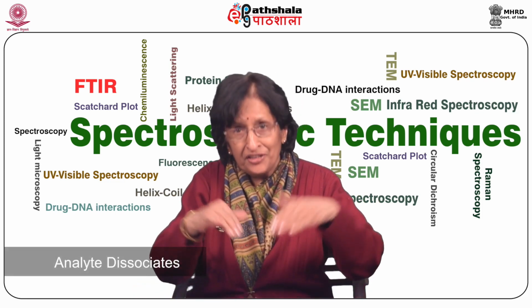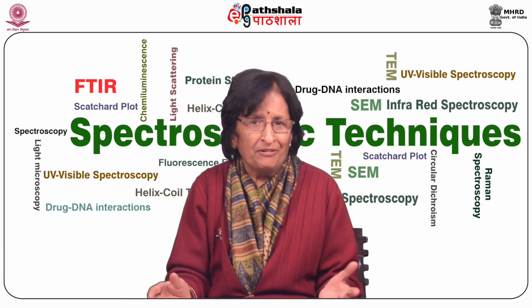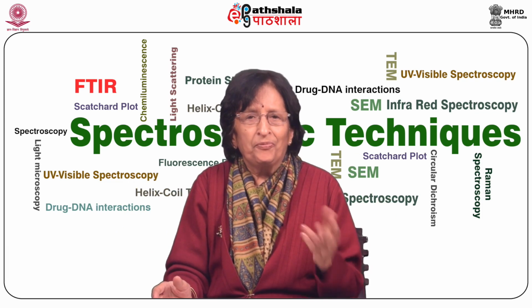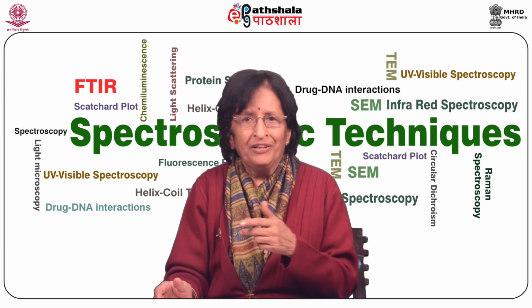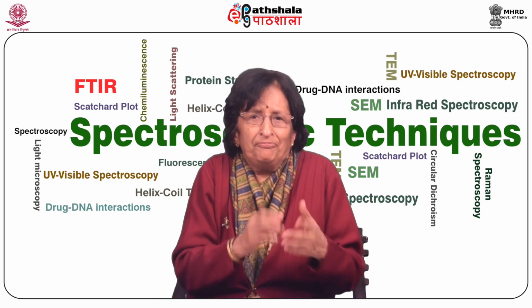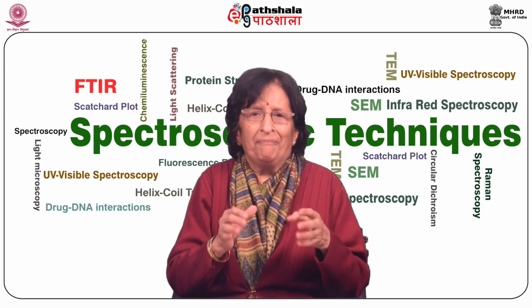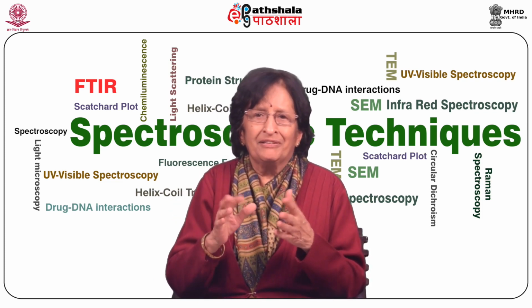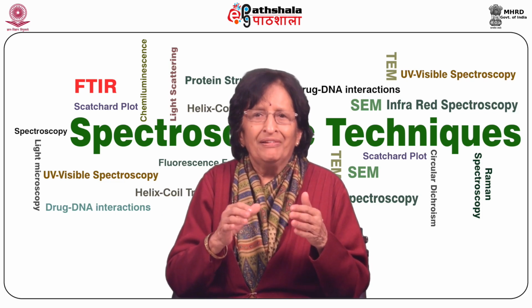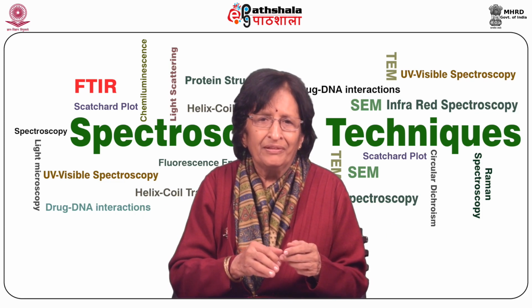Now, if the analytes dissociate, associate, or react with the solvent to produce a product having a different absorption spectrum from the analyte, for example, a particular sample having color 1, then it dissociates, gets some H atom and some other molecule of color 2, then you will get a wrong result.